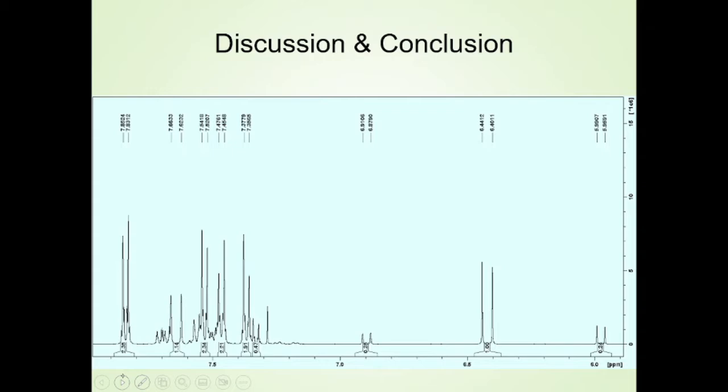This is the data you have, and you work with what you've got. And there's not anything we can do about it. We just accept the fact that we're not going to find all the peaks, and that's okay. Any questions about the NMR? And if you have specific ones with your NMR spectrum, when we're working on calculations to submit that, you can bring those up as well.